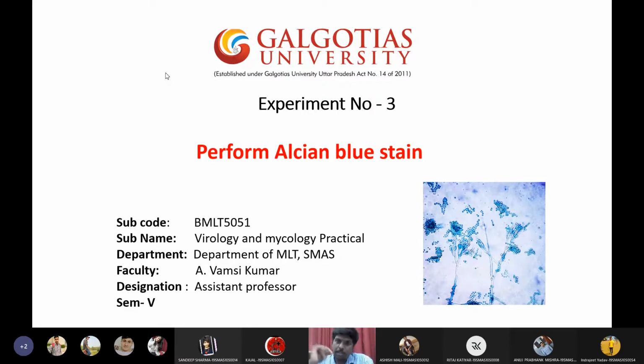The problem with negative staining is that even a small fat bubble will be falsely identified as Cryptococcus neoformans, because fat also won't stain. The background will be stained and the fat will appear unstained, and we will think it is Cryptococcus, giving a false positive report. So rather than trusting negative stains, better trust the special stain.